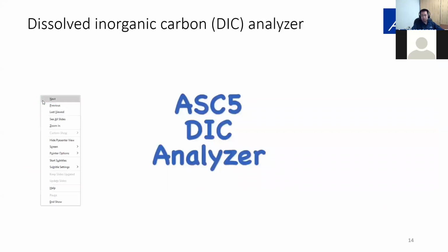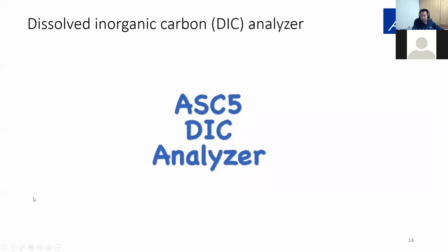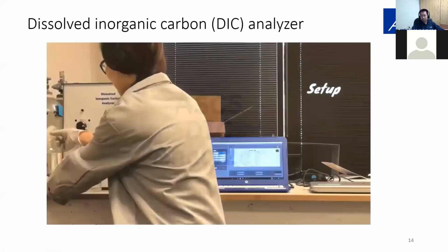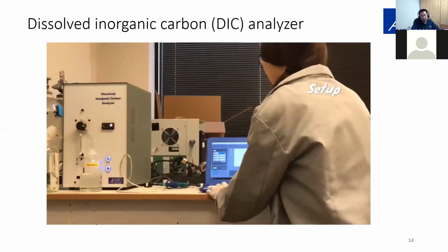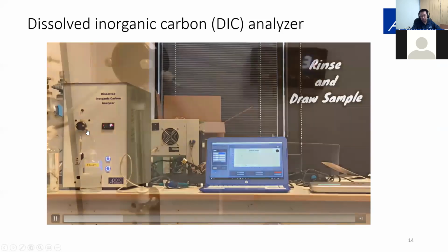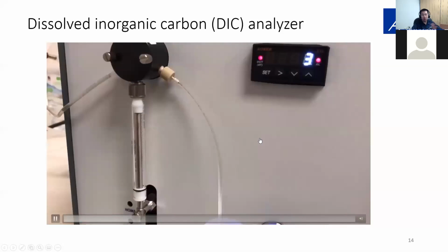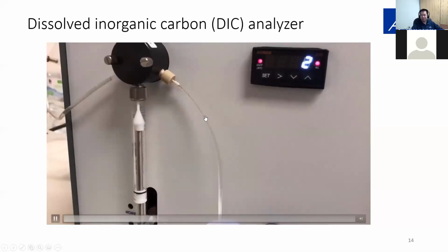Here, I want to show you a video of the operation of the system. In the video, we have a single sampler. Again, all the standard and sample have to go through this same port. But the whole process is still automated. You just have to come in and change the sample.